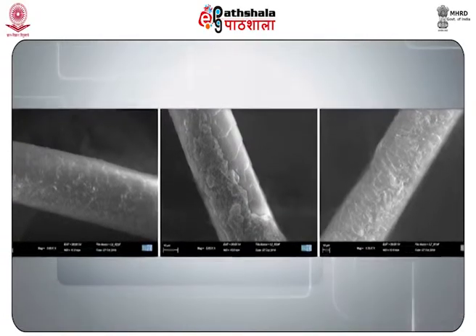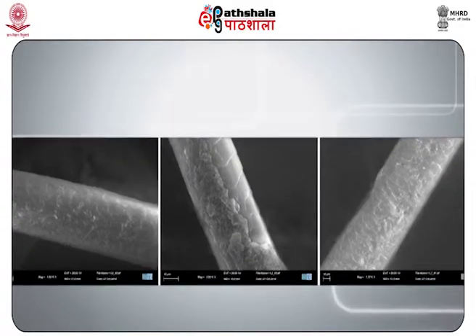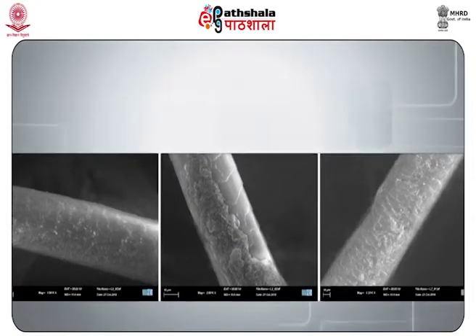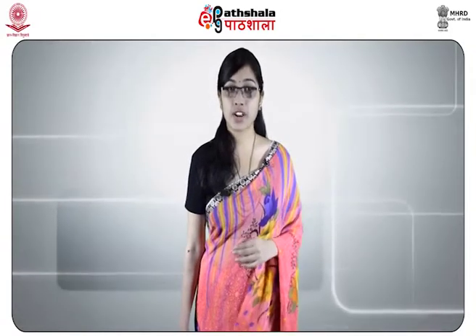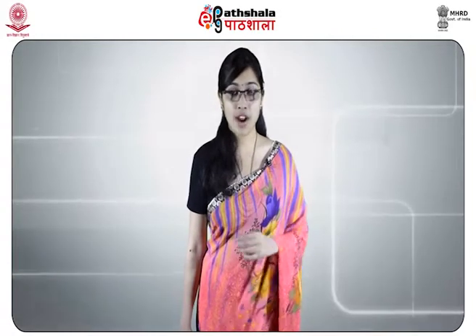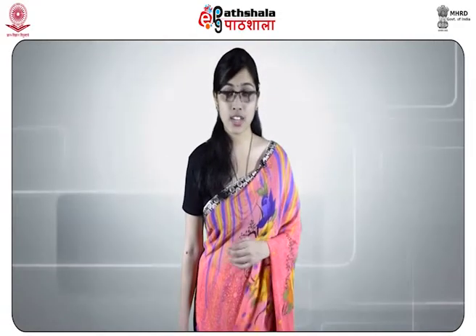The objectives and the eyepieces selected should permit observations in the range of approximately 40x to 400x. A high intensity tungsten light source suitable for photomicrography and equipped with a daylight correction filter is present for providing adequate lighting. Both sides of the comparison microscope should be balanced for light intensity and color.